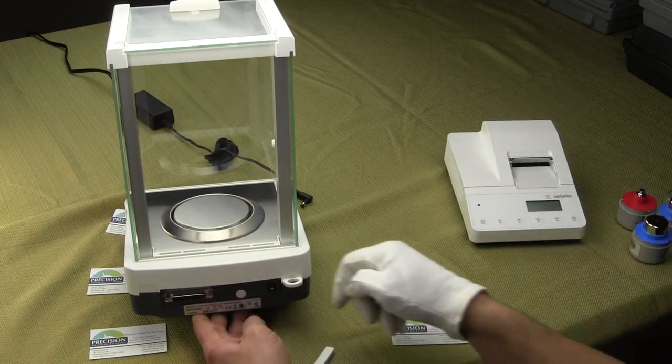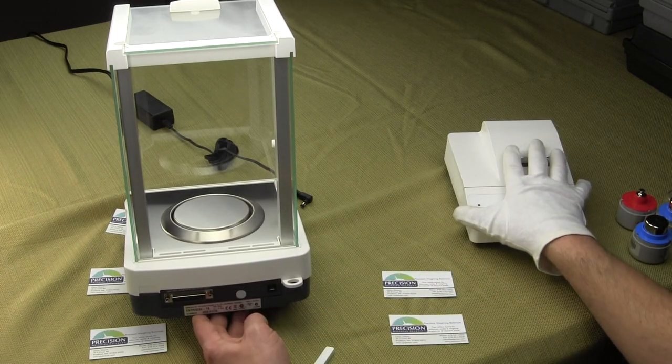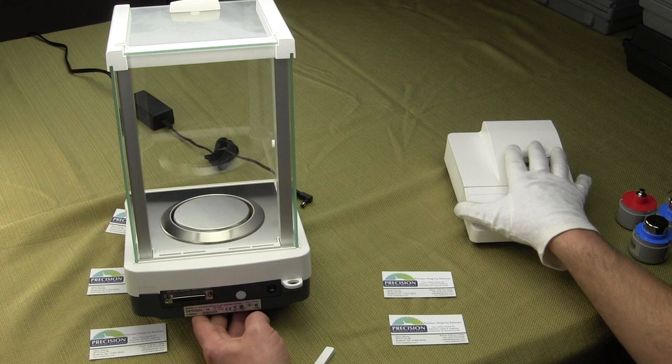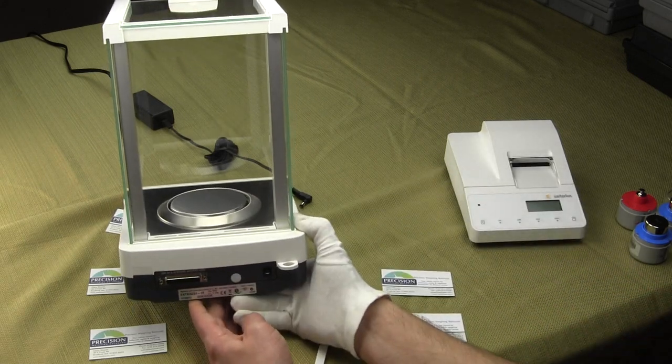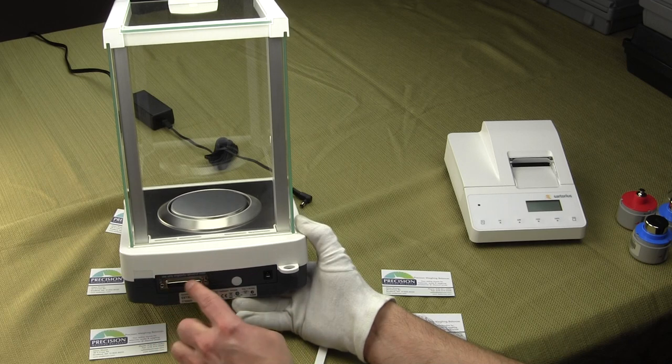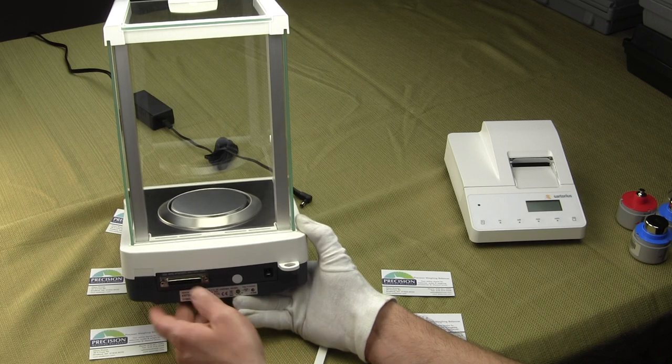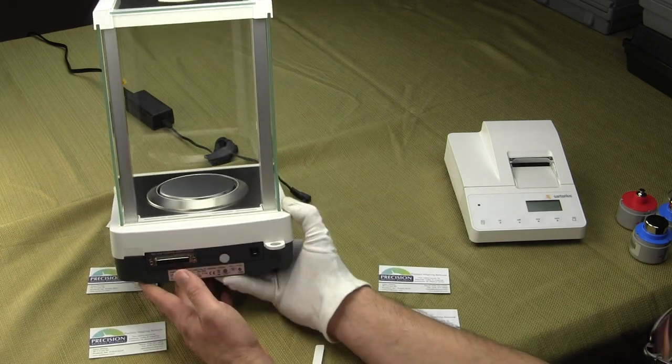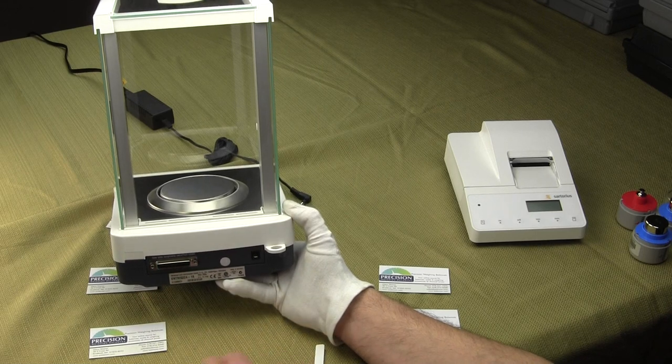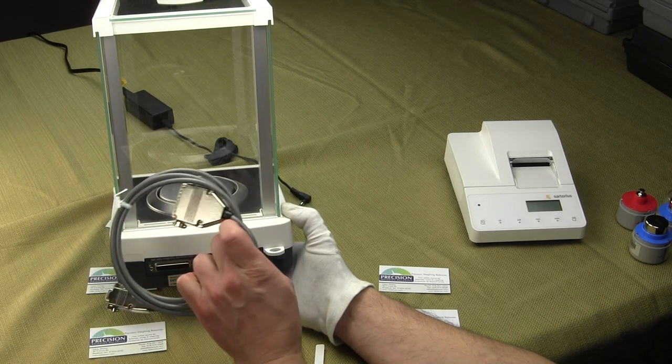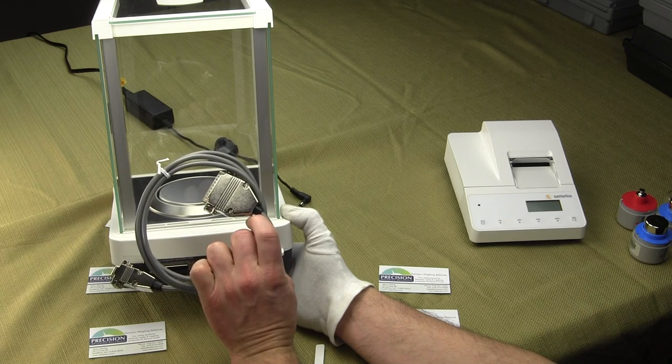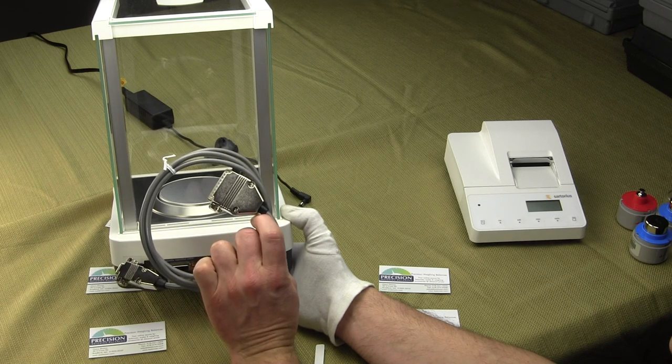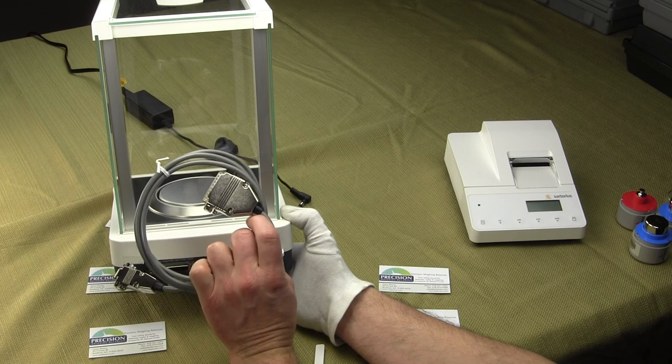If you buy the YDP-20 printer, it comes with the cable needed to go from the balance to the printer. The serial interface on the back of the balance can also be used for data acquisition. You would have to buy the optional Sartorius RS-232 cable. This is Sartorius's cable, not a standard serial cable.